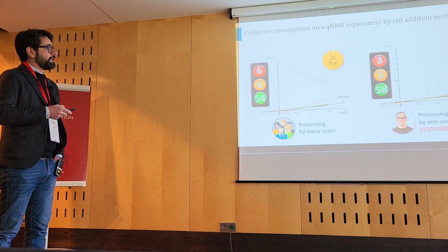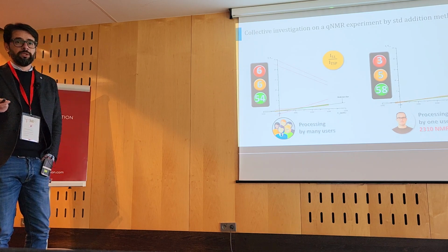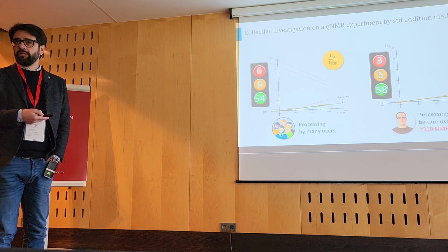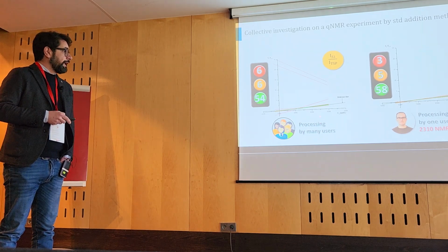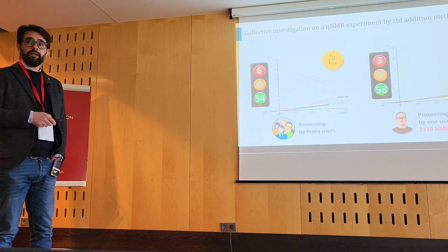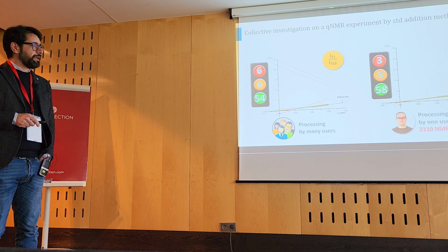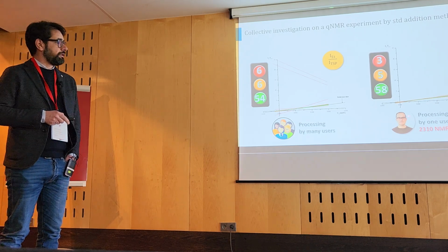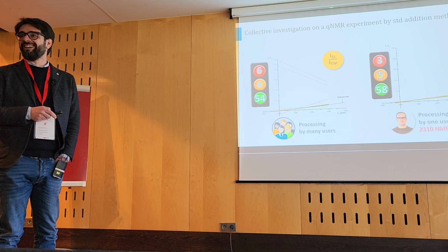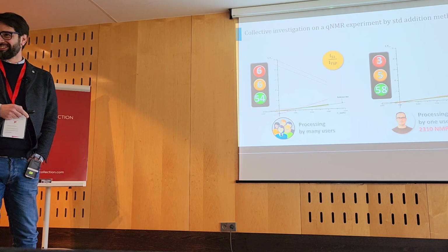In principle, if the ratio between one signal and the reference signal should be the same for each spectrum, independently of the spectrometer, then also the calibration line should be equivalent for each laboratory. But this was the result collected with data processed by the labs. But when the same data were processed by only one person, Stefano Todisco in our lab, the calibration lines were much more aligned, regardless of the number of spectrometers processed.